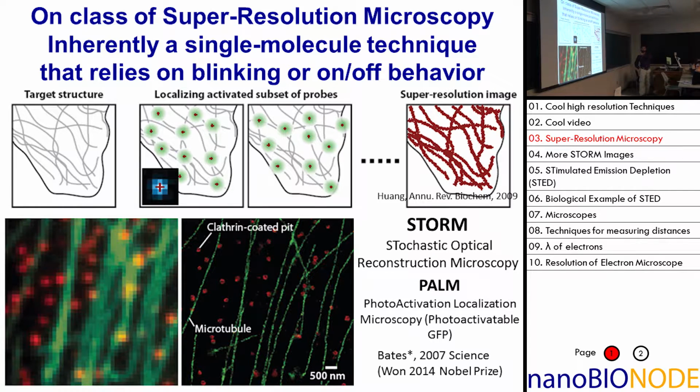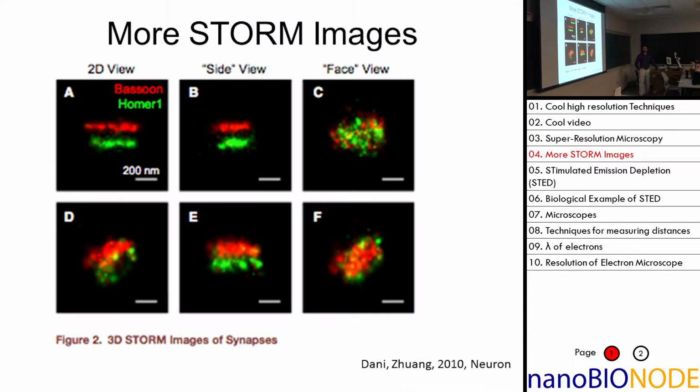Okay, so this is all material that you will know for the final. Okay, and you can get some amazing pictures, and this is, for example, at the end of one nerve, and this is on another nerve, and they're not quite touching. In fact, there's like a 40 nanometer difference between them.